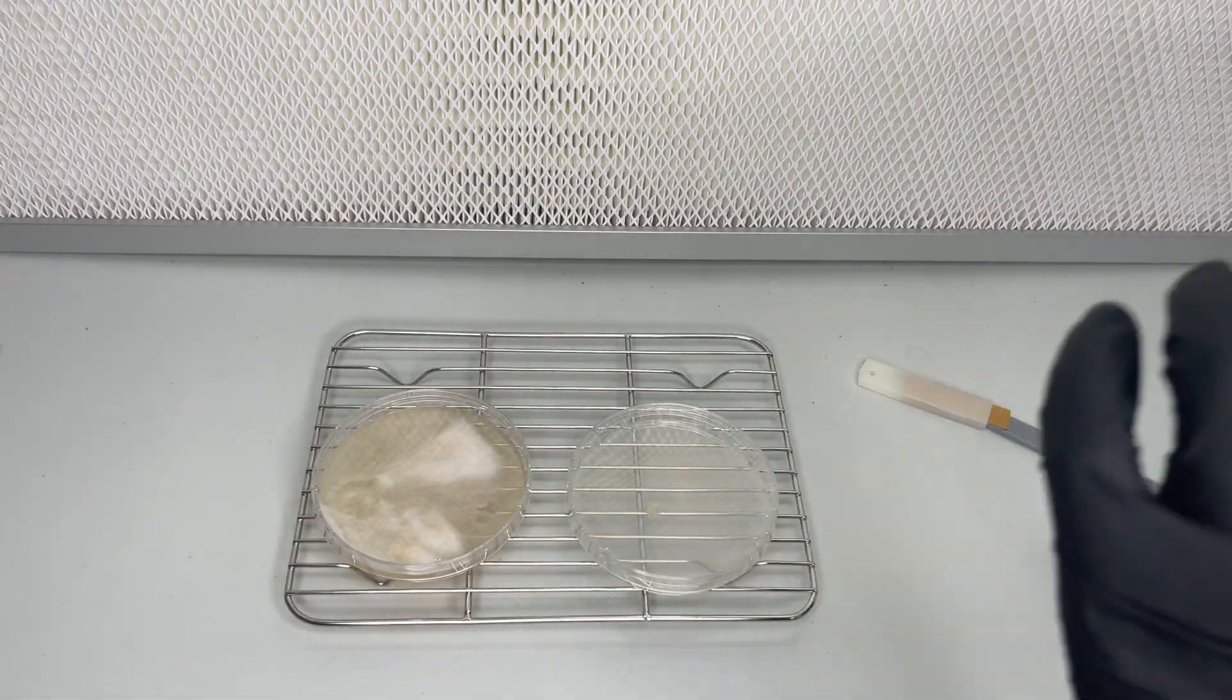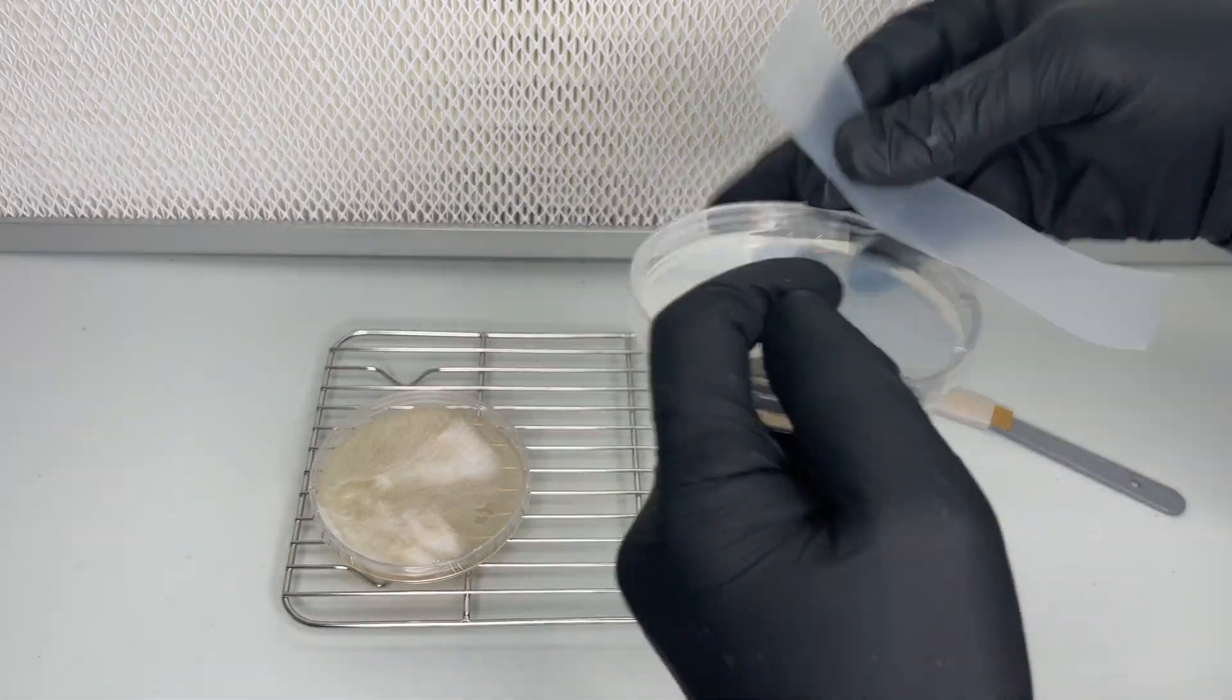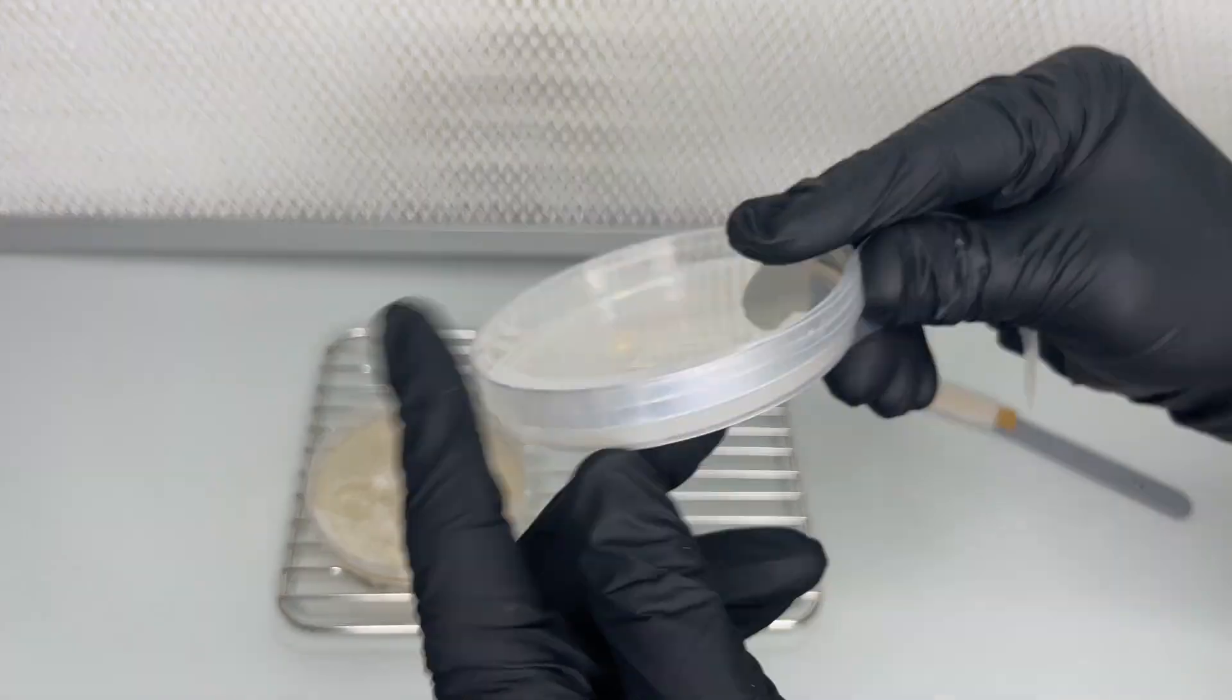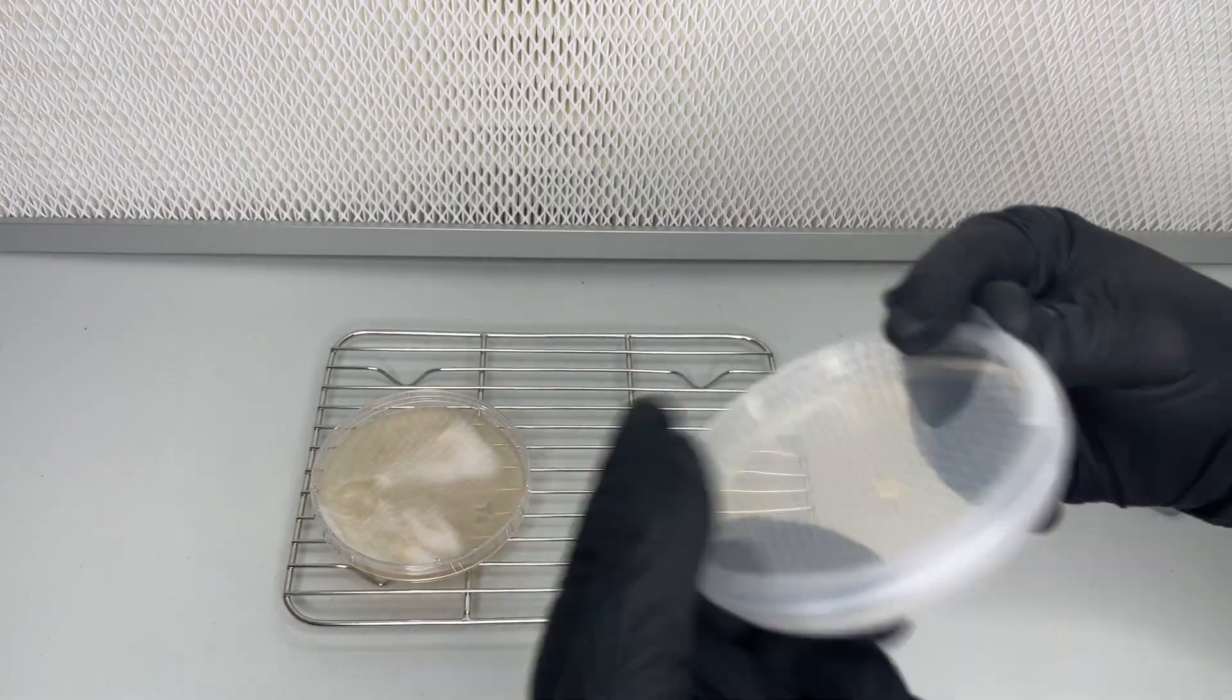The water agar plate is wrapped in parafilm and allowed to grow for one week at around 75 to 78 degrees Fahrenheit.